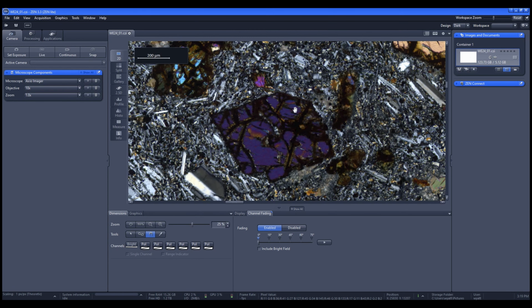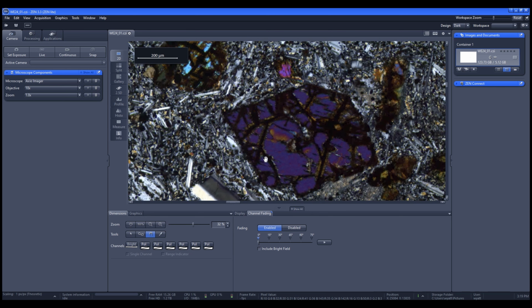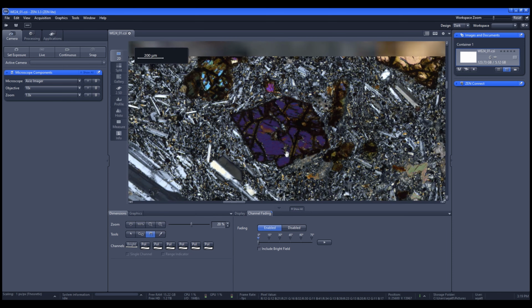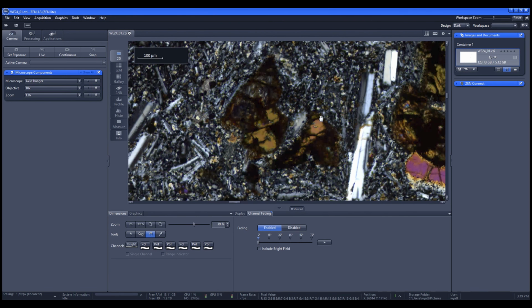And you can see this is a nice olivine crystal here. Very euhedral. If you're not familiar with what that term means, think of a beautiful quartz crystal, or any crystal, if it has crystal faces. When you see crystal faces, it's euhedral, when you can see the actual shape of the crystal. If it's just kind of a blob, think of a quartz vein chunk, that would be anhedral. If it's somewhere in between, it'd be subhedral. But for this crystal, this is a nice euhedral olivine. You can see the crystal shape of it. And then something like this would be more anhedral. There's not really any defined shape happening here. It's just kind of a chunk of crystal.